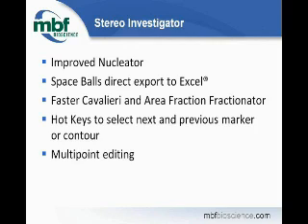The first one that they've done is that they've improved the Nucleator. We've added a single middle marker click to be able to close your current Nucleator. It reduces the number of clicks you have to do while you're measuring. And also we have added a marker interval to the Nucleator, so if you're doing it in an optical fractionator, you don't have to measure every cell. You can do it on a sampling of your cells.